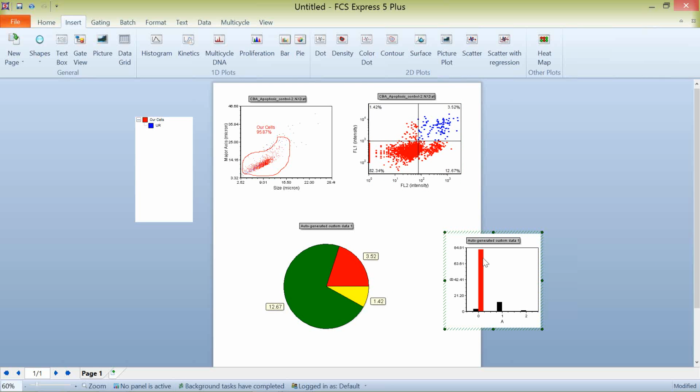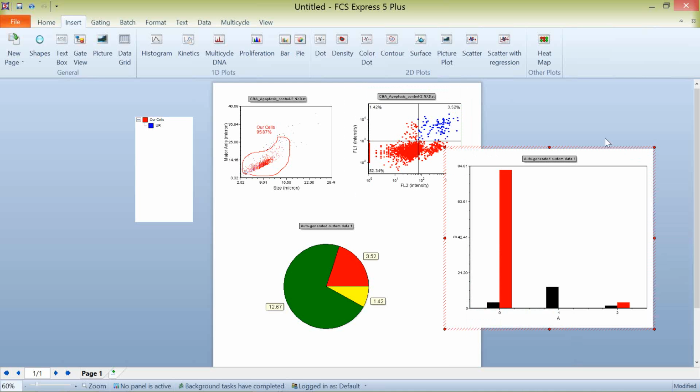And if I drag it towards the bottom here, we'll add it as a new series. You can always add series here by just dragging and dropping. You see it's going to highlight which series we're going to add it to, and then it will pull it in to that bar chart. So again, this is very quick and easy to create now. In version 4, it took a little bit of time to do this.